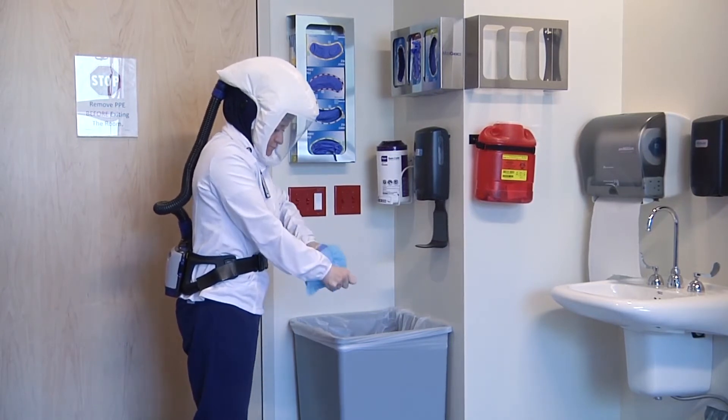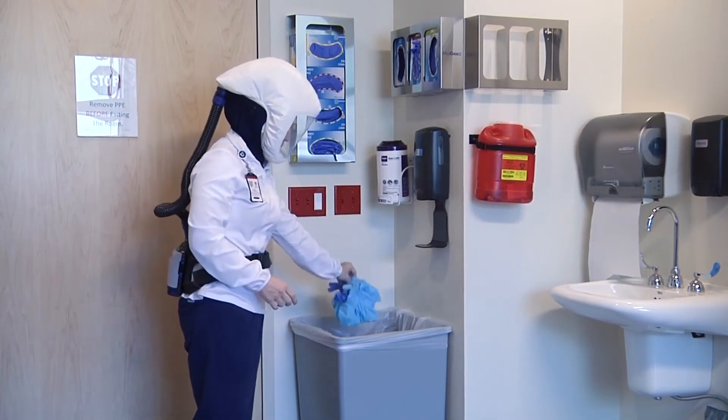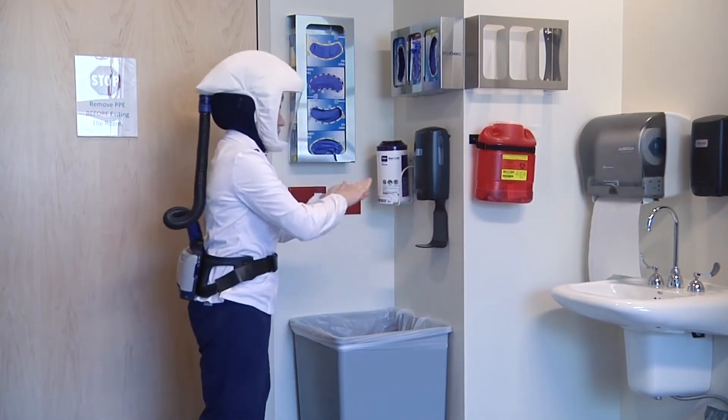Do not put your hands behind your back. Place gown in the trash bin. Perform hand hygiene and exit the room.